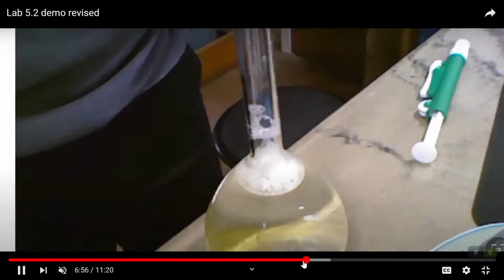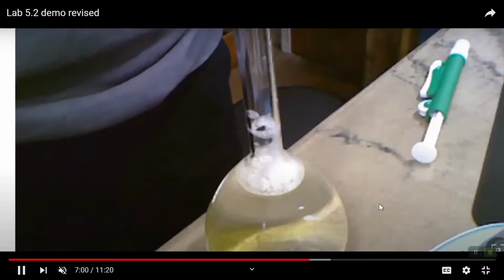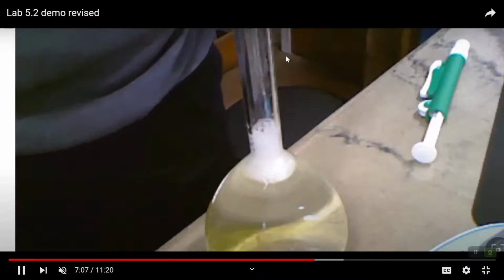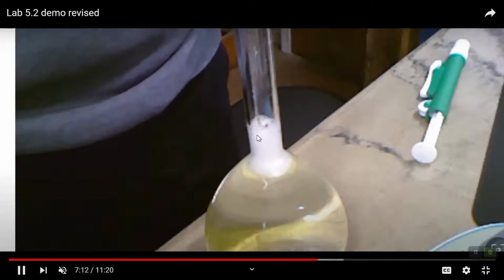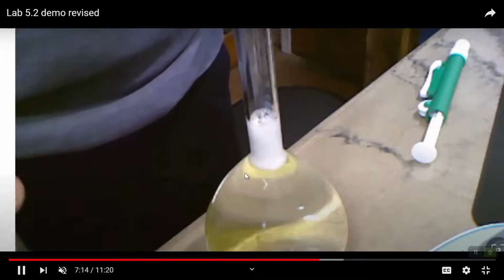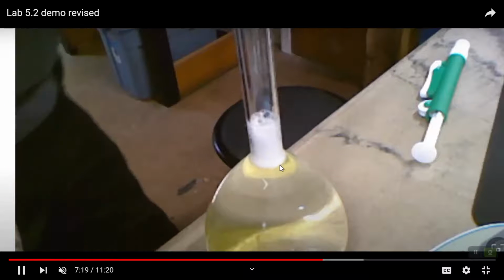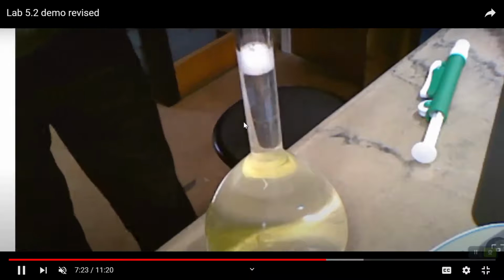And then we're going to have to deal with the fact that it tends to produce some foam on the top because it is a soap. The foam is not going to help us at all in determining the volume, because my volumetric line is someplace right up here. So I'm trying to bust up the foam so that I can see the actual water line right there. And I'll do the best I can. And when I get up there, it's kind of hard to see. It looks like the line's down here, but actually the line for this volumetric flask is someplace right up there.